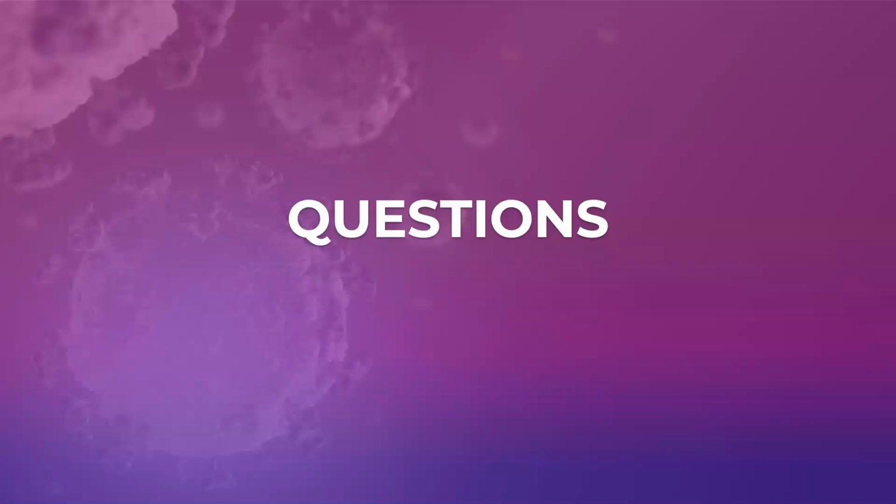Okay, so let's pause. I'm going to add another few minutes at the end for the questions. I do recommend going through the specific example in SF9 that will show you how some of the things that you were asking in today's session actually play out in a real situation, right? So here we are dealing with a simplified situation.